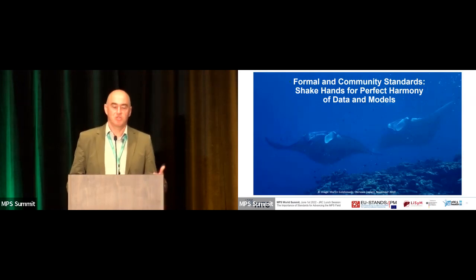So what I wanted to show you is that formal and community standards both are relevant and important for describing data in the MPS world, but also in the whole world of biological data and biotechnological data.